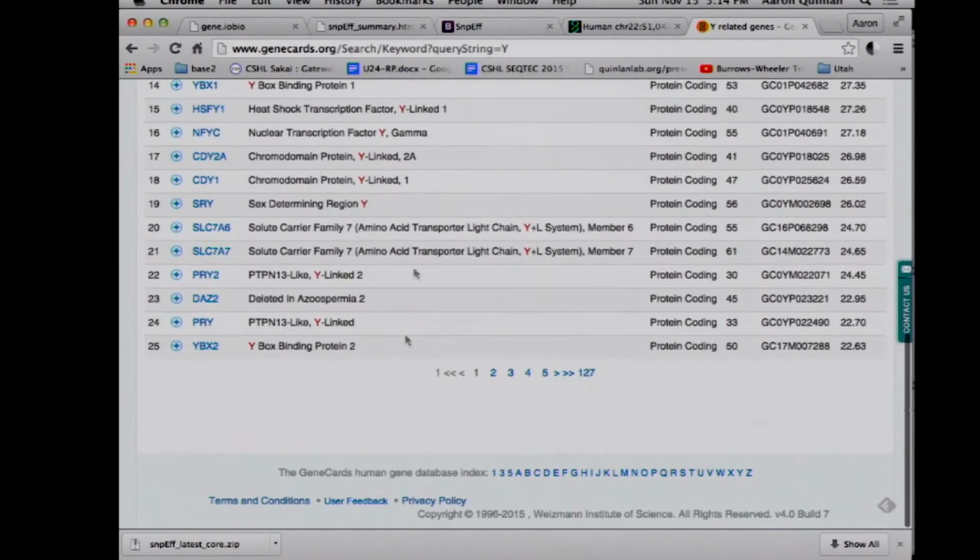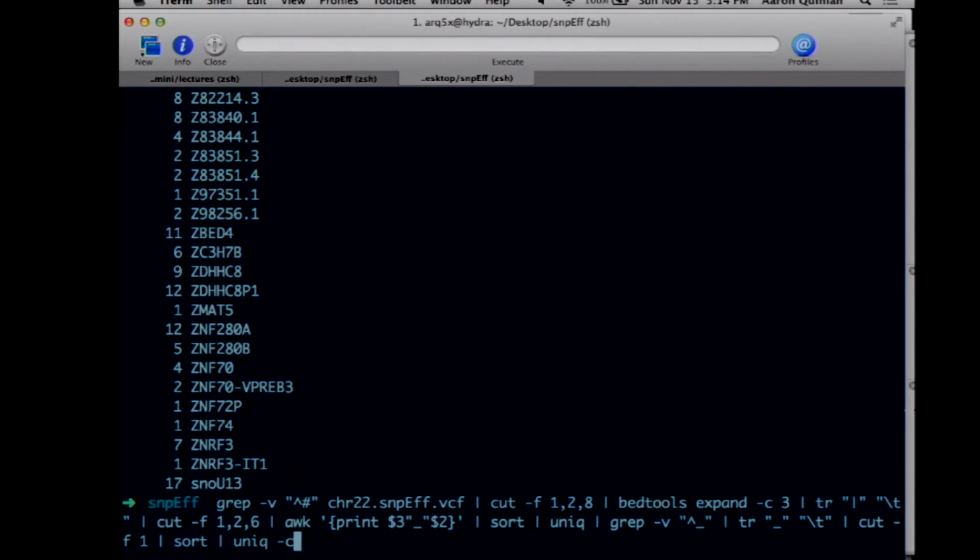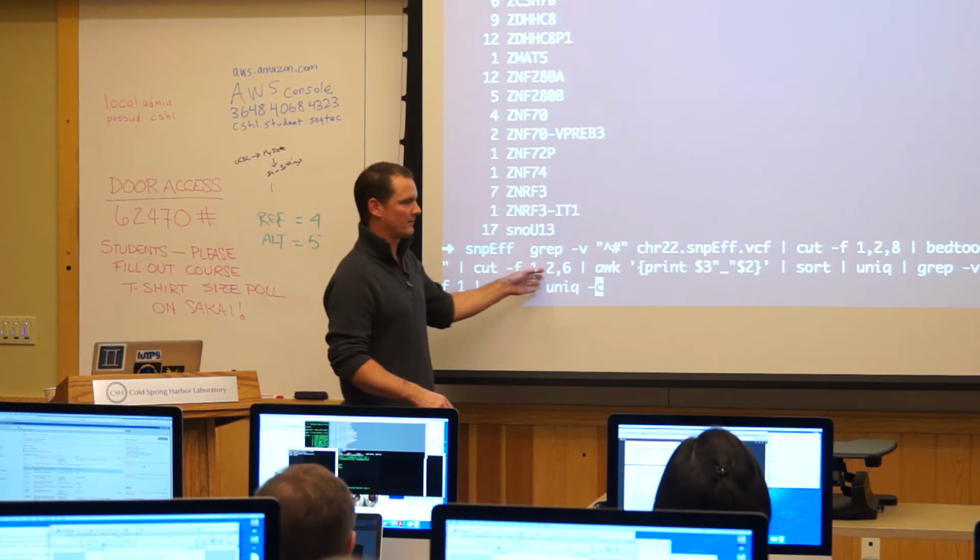I don't know. Okay, so there's another way to do this. Well, there's the way that Jim proposes. There's also tools. I'm going to talk about a tool called groupby in bedtools tomorrow that would basically short circuit this. At this point, we could just feed it into one command and it would have done all this. But anyway, I think it's just helpful to think about how you can.